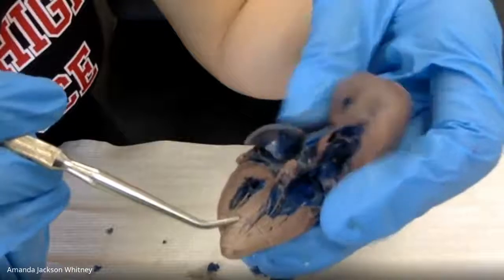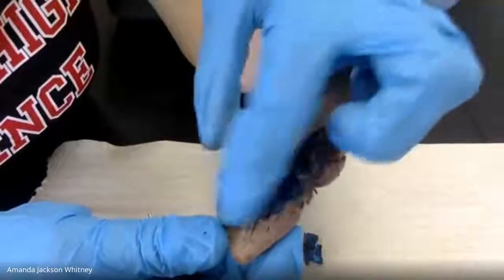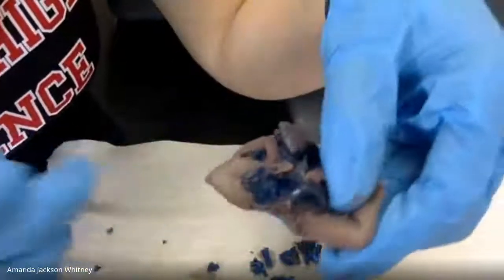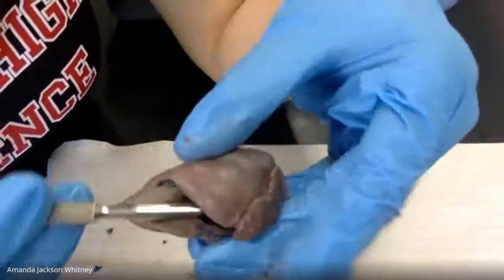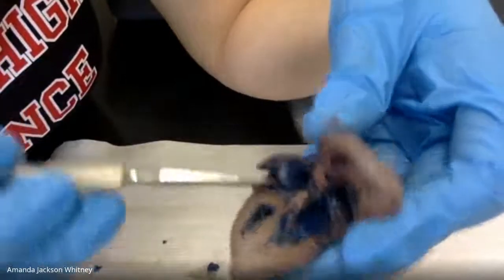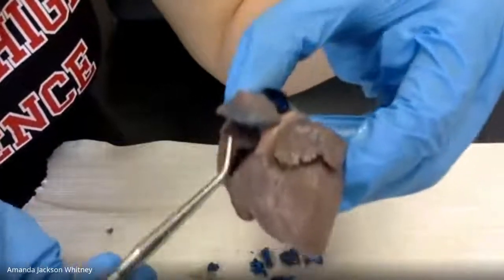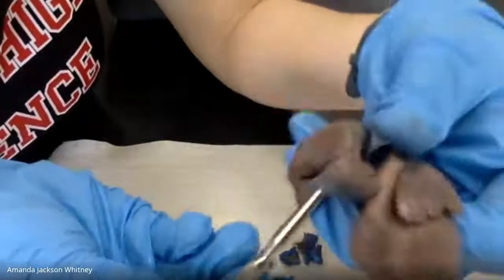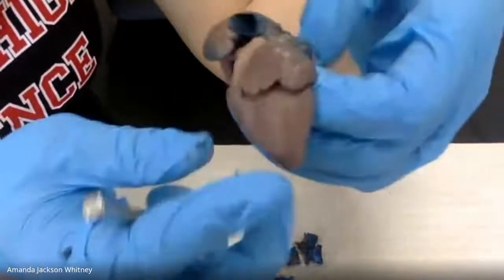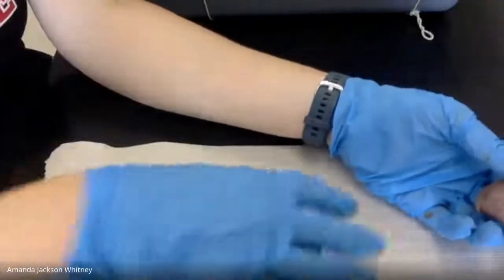Little heart. Atria are very small. As you can tell, these are the two ventricles. The atria are much, much, much smaller. One of the atria, this right here, is the left atria. And then the right atria is even smaller. It's full of latex, which is kind of annoying. But it's this chamber right up here. Cool. Any questions on the heart before I take out the lungs?